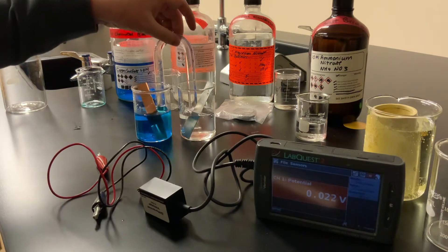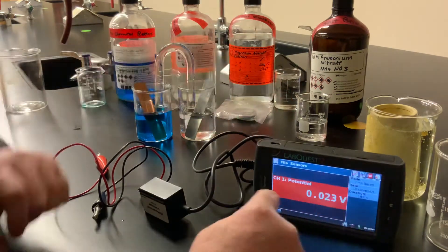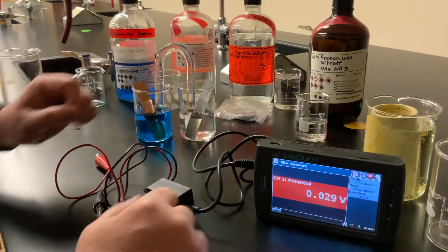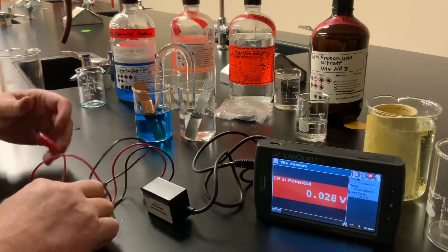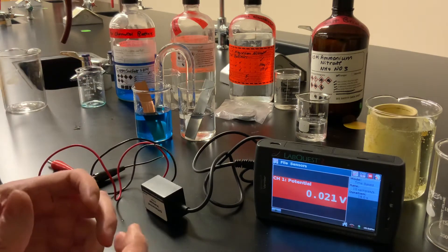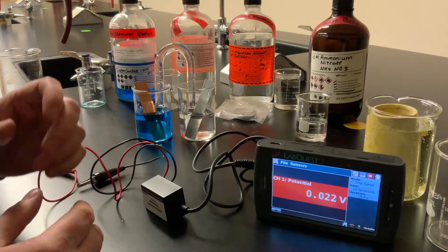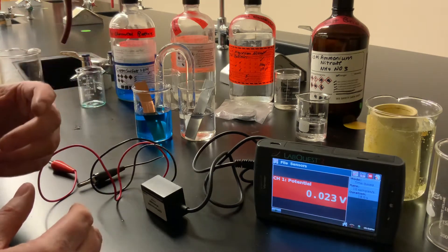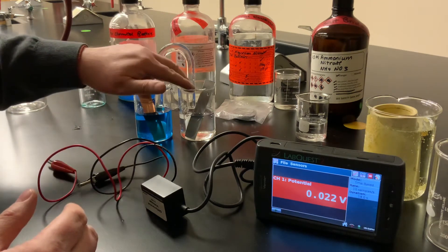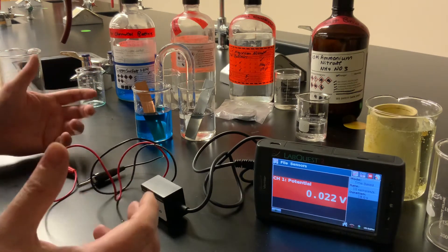So now the U-tube is connecting the two half cells. I've got a Vernier LabQuest connected to a voltage sensor, and on the screen here you're going to see the voltage reading. Now, if you have a table of reduction half reactions, you might want to pause the video and take a look at that. What you want to decide by looking at the table is which of these two half cells — the copper half cell or the zinc half cell — would be the cathode in our voltaic cell and which one would be the anode.